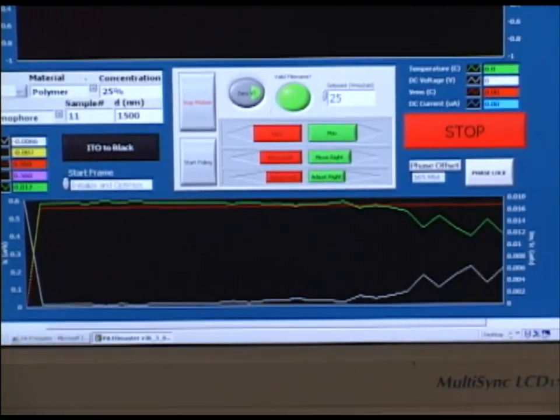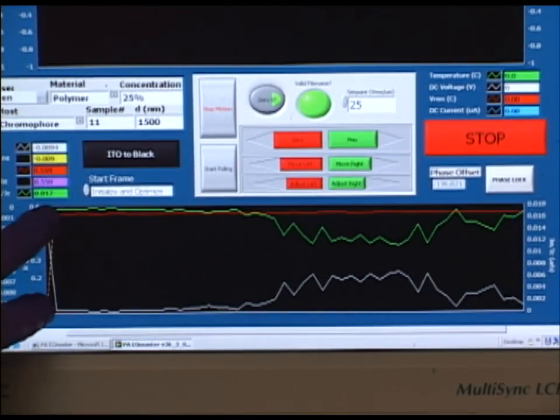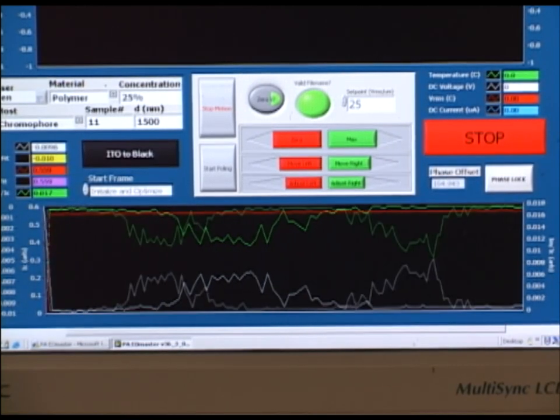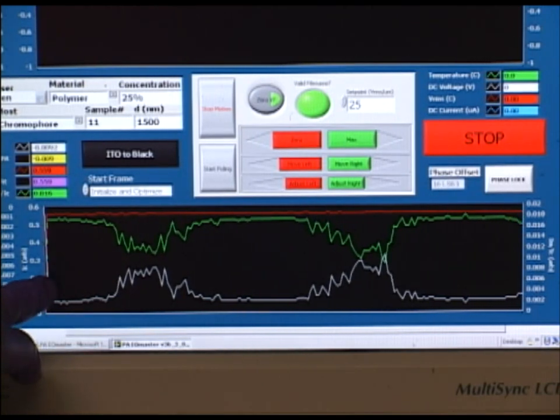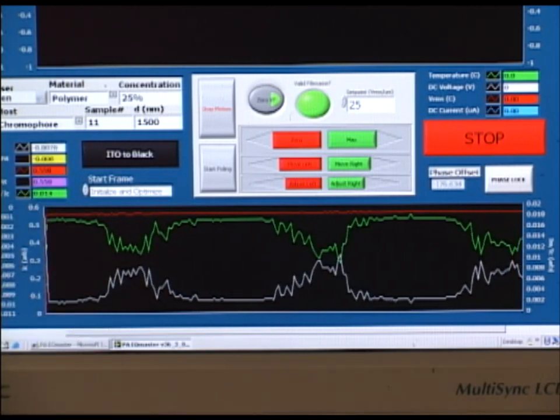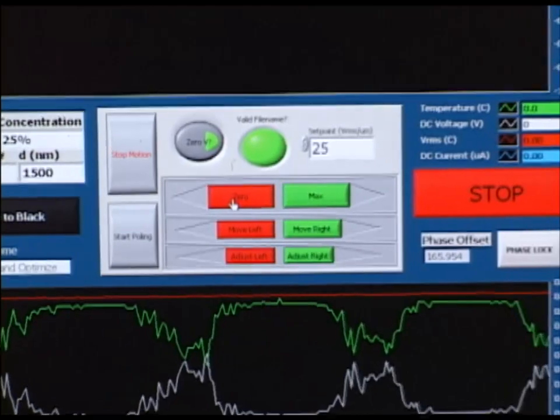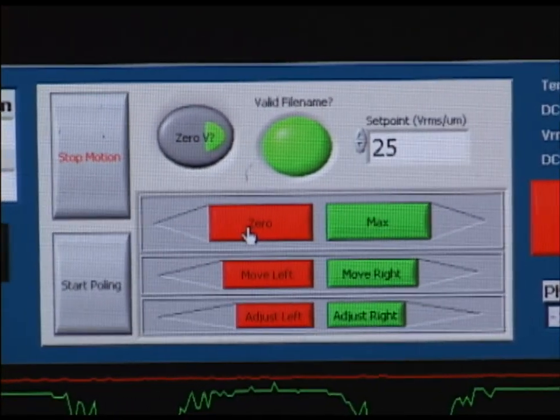Now the instrument is running and we can see here a graph on the bottom with three separate traces. This is optical data coming from the infrared laser that is incident on the sample at 45 degrees. This optical data is the intensity gradient derived from a phase shift related to birefringence induced by Pockels effect. What we want to do is maximize the signal by adjusting the compensator. These buttons here activate a motion controller which rotates the compensator so that we can find the best position in order to obtain signal.